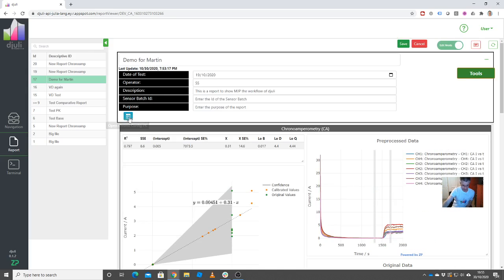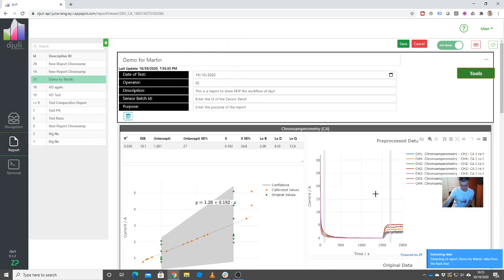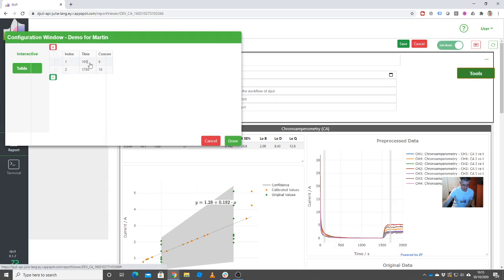Now, I said I was going to come back and talk about these 2 gray bars here, because effectively, if we go into here, I'll just show you that, for example, if I make this 100, it's basically going to put the line here. So what it's basically doing here is saying here it's 100, it's 0, and here we were at 10. I'm just going to shift that around a bit more and put it in a more sensible place. I'll put it at 1,000.